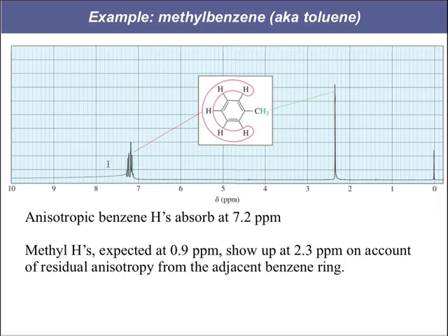So that is why we get the jumbled mess here, because really this is 3 different signals. It's the hydrogens that are closest to the methyl, the hydrogens that are farther from the methyl, and the hydrogen that is farthest from the methyl. The only thing is that the ring is such an overpowering effect on the environment that the distance from the methyl makes very little difference in the chemical shift.